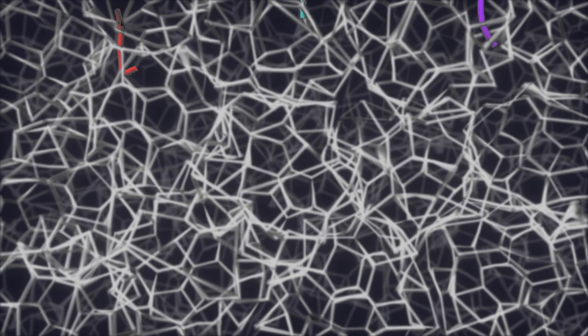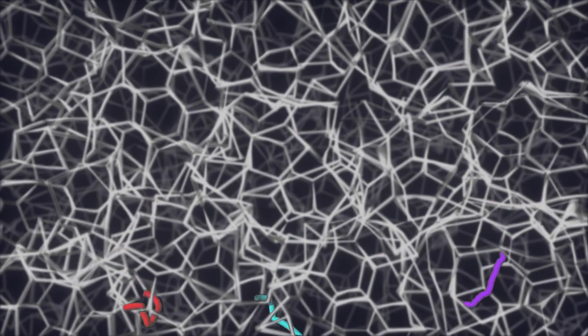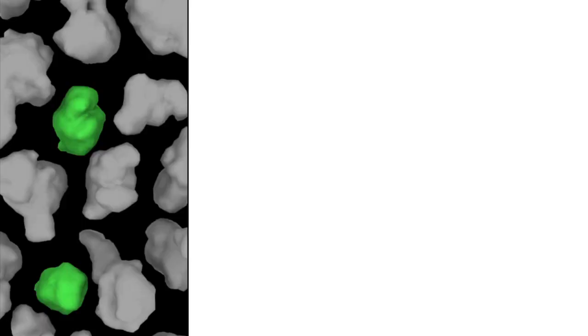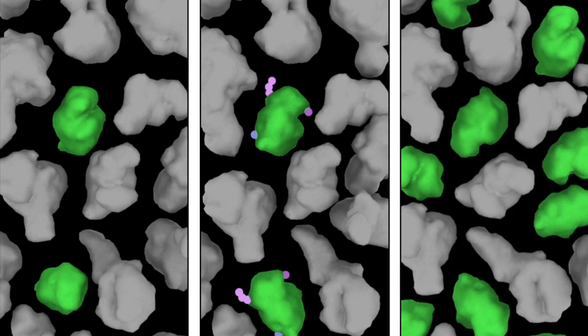By the same token, proteins with similar mass but different overall charges also migrate through the gel matrix at comparable rates. This property of SDS PAGE makes it particularly suitable for assessing changes that affect the mass of a protein, such as covalent modifications or changes in protein expression.